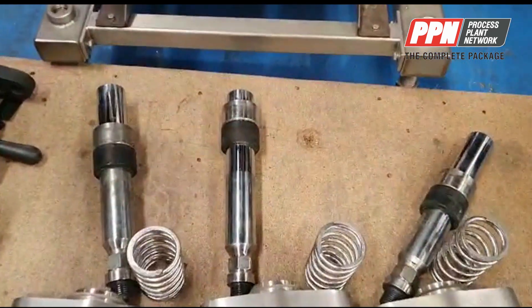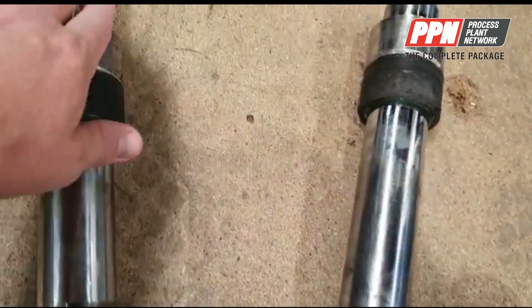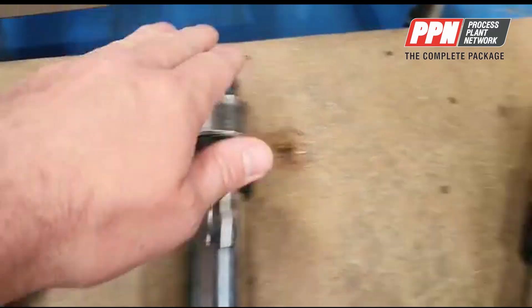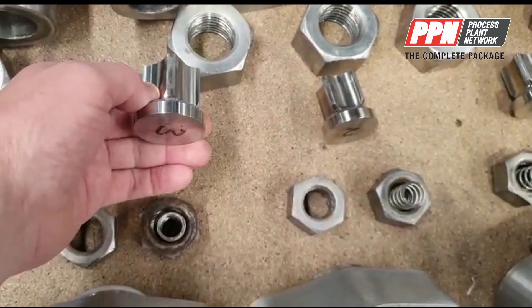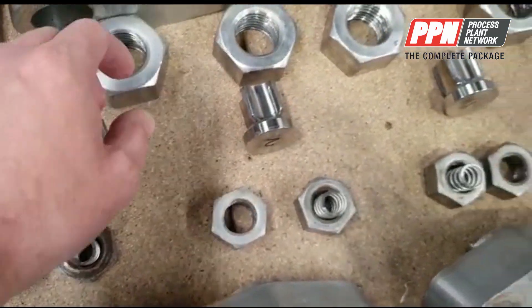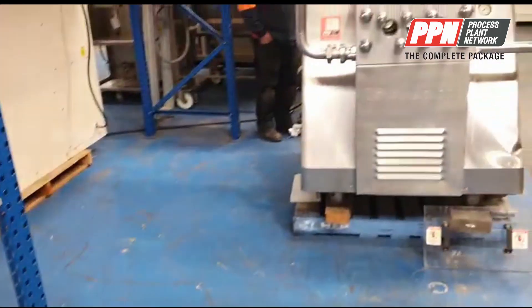You can see the pistons are in excellent condition. There's no scoring whatsoever on these pistons or any of them. And you can see the poppet valves are in excellent condition as well. So we'll start it up for you now.